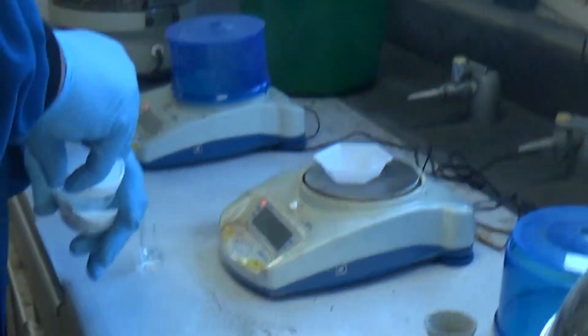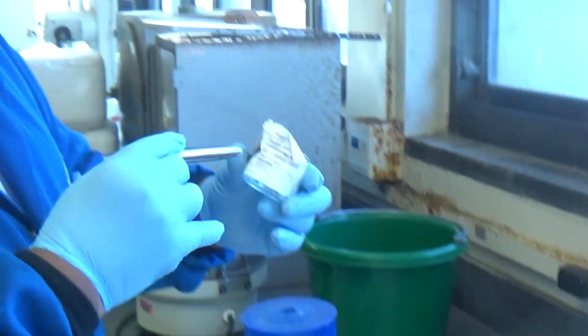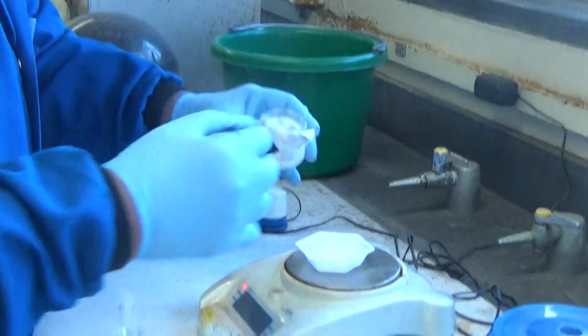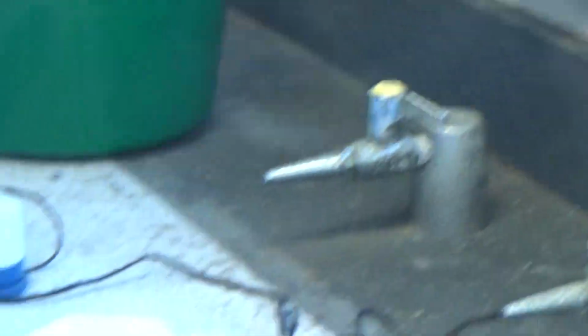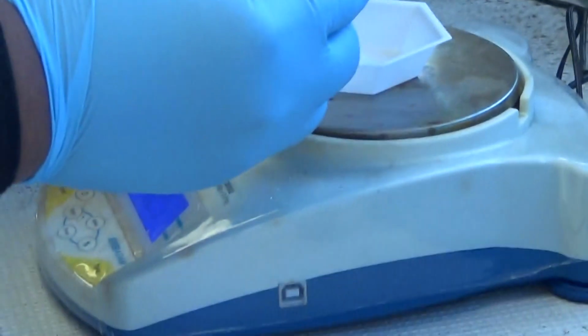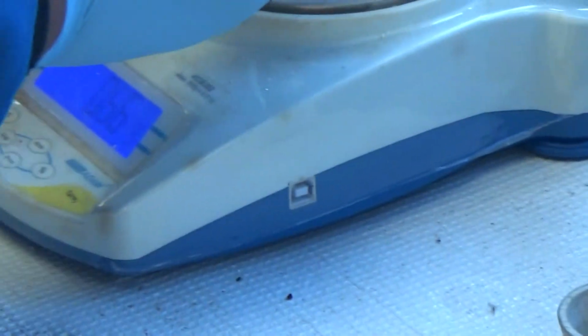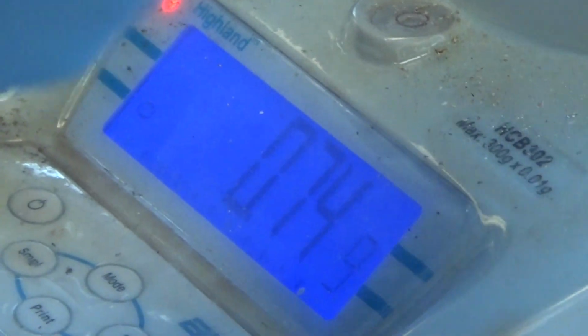We hope that what you have here is really pinacol. We need 0.75. Almost a little over. We're on the cusp. Uh-oh, 0.74. We're close now. There we go.